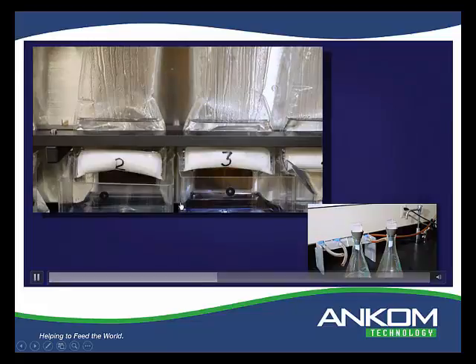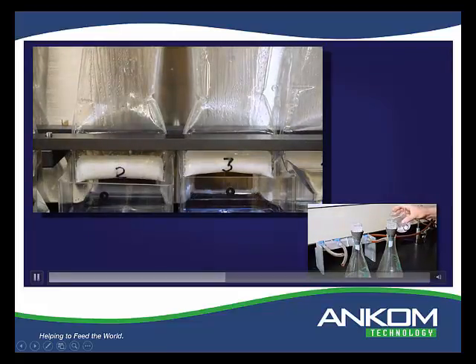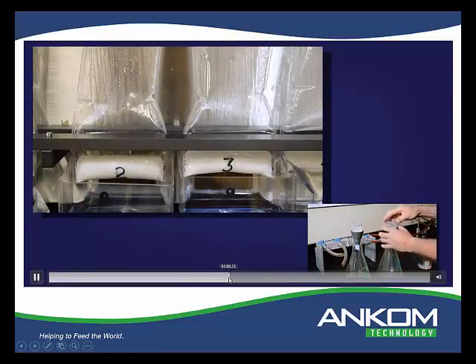Okay, so the rinses are almost finished on this side. Remember, a total of 4 different rinses have to take place here. Here, oat bran is still filtering, pectin is still filtering, and still trying to get the beaker emptied. We'll go ahead and speed up a little bit here.